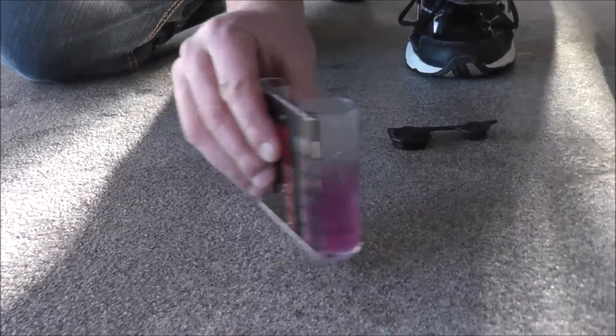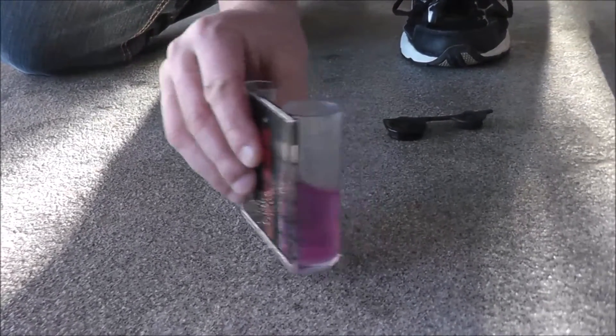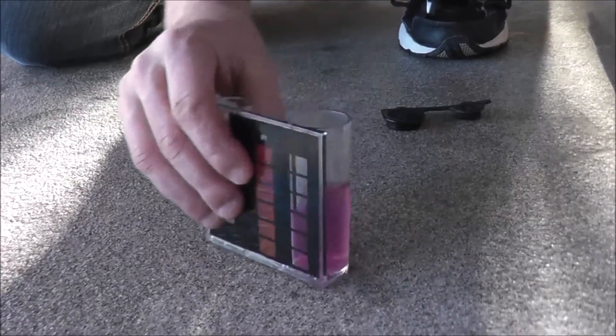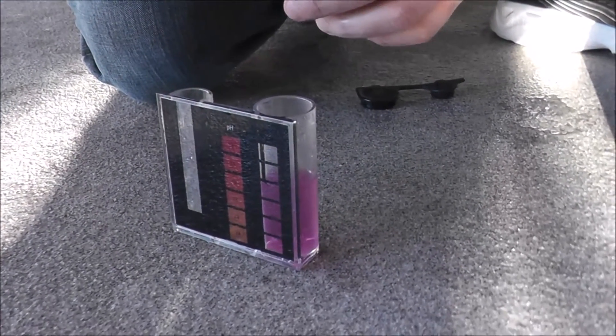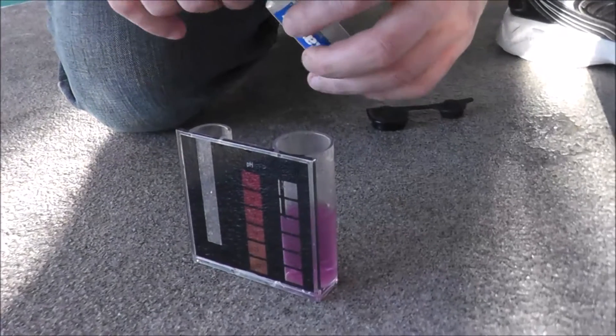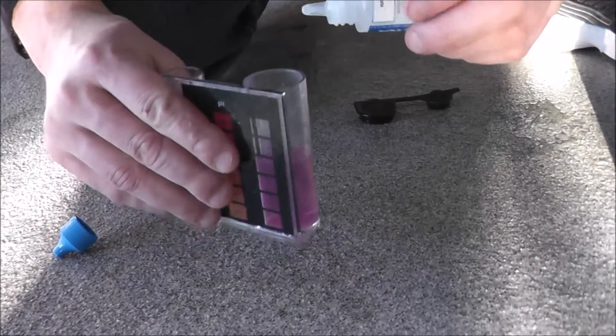Now the last step is adding the reagent that will turn it from red to blue, and that will tell us how much calcium hardness is in the water. Each drop is 10 parts per million. We've already tested the water, so for the sake of the video we're going to add them faster, but normally you'd add one drop at a time and swirl in between.